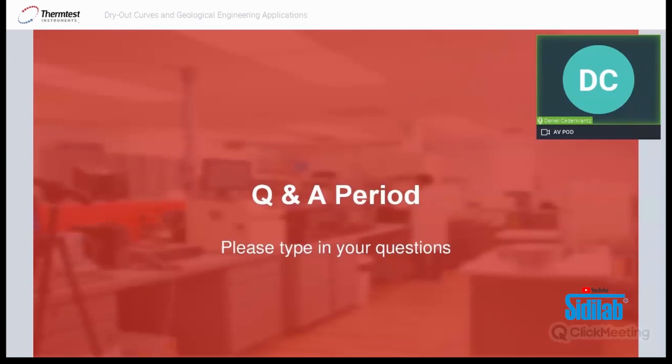That can give you drift. But in general, if you test in the lab, if you leave the sample in the room to stabilize before starting testing, you should not really see drift. You could, of course, also test the sample in a fridge if that's more close to your application. As long as you have a stable temperature in this fridge, and if you wait long enough between your tests, you should not see drift. So the main way to reduce drift is wait for temperature stability.